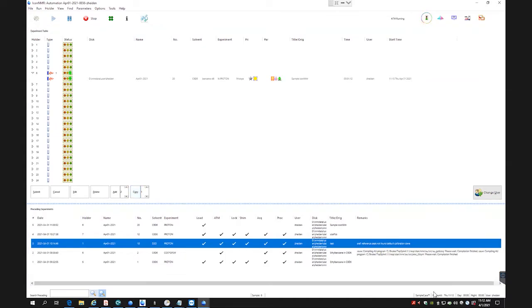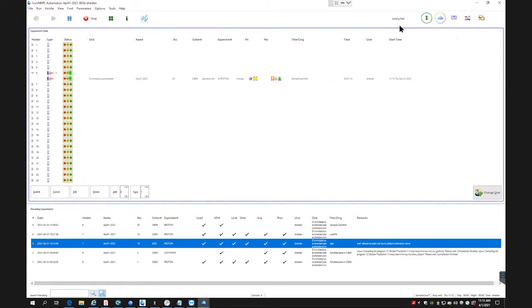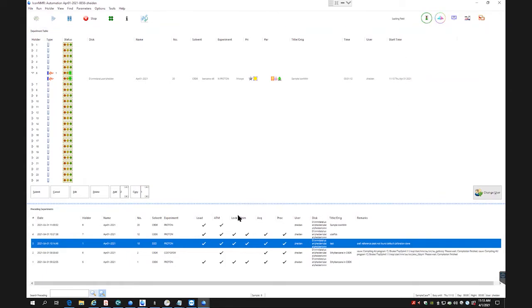It all depends on how many samples you want to submit and include. You can also see that if someone is already running samples, when you come up, it'll say the sample case is busy until 11:13. As you can see here in the clock, it's 11:13, so it'll be pretty quick once it's done. So right now you can see it's locking. The tuning and matching is finished. So this is now the locking icon. But as you can see, it'll be busy until 11:13, so that gives you an idea of how soon your samples will run if someone's already using it.